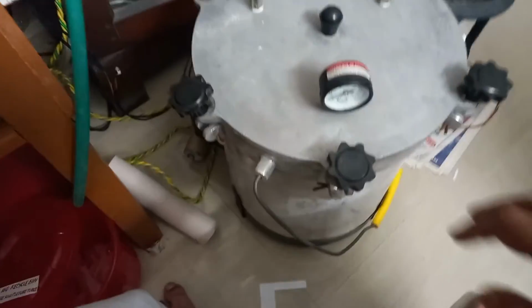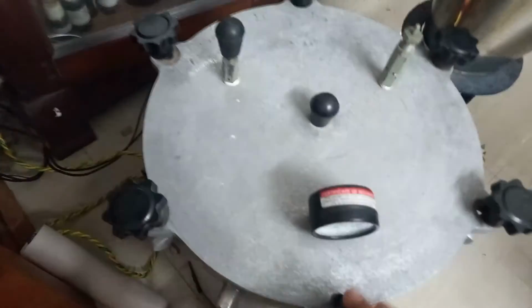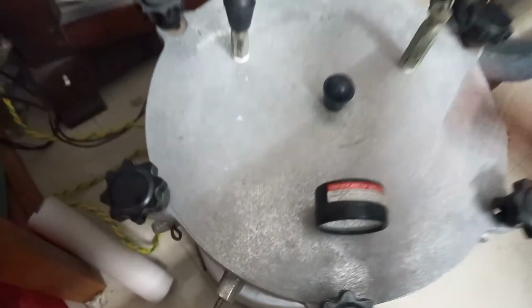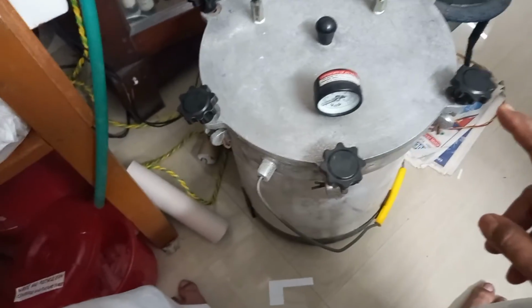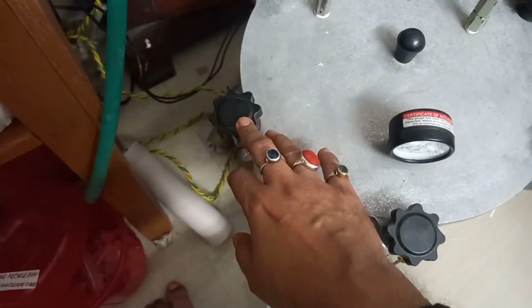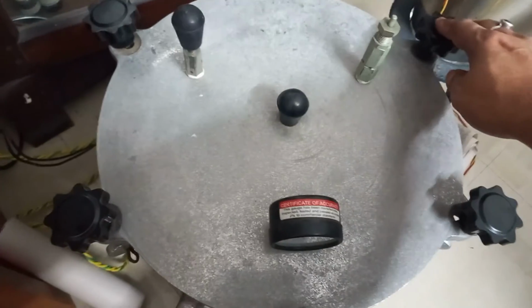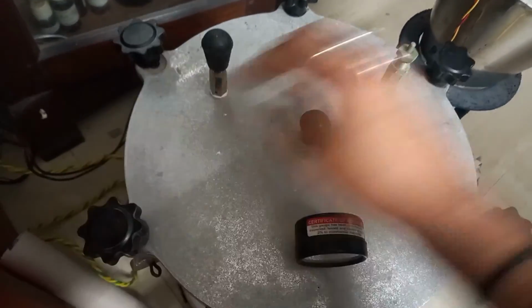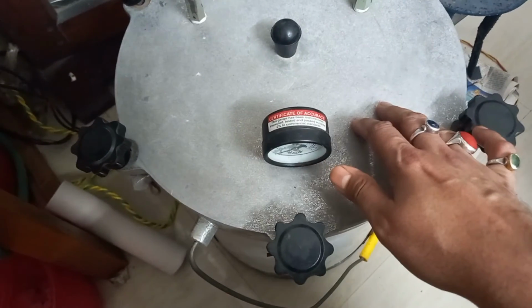One thing is that you have to tighten the knobs on one side and then the opposite one. Again this one, and again the opposite one. Otherwise this whole lid will bend, so you should be careful. The first step of tightening the autoclave cover is to take any one knob, but you have to tighten the opposite one next. If you start from this one, then you have to tighten this one. By one hand you hold this one, the other hand you hold this one. Then fully tighten it so that the lid does not come out.